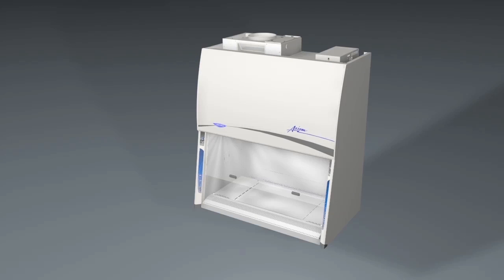The world-class design of the Purifier Axiom Class II Type C1 biological safety cabinet is the result of decades of containment and safety engineering.